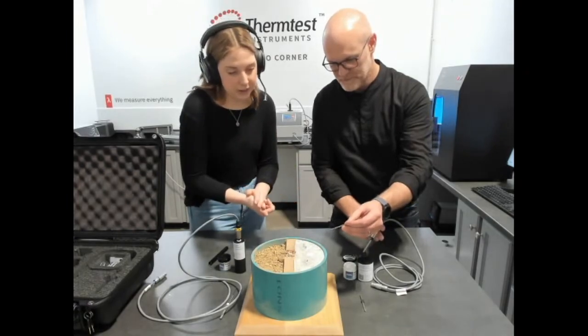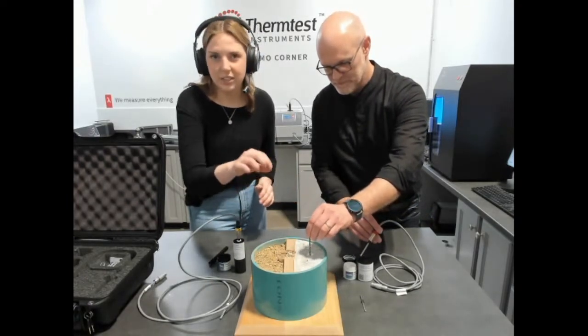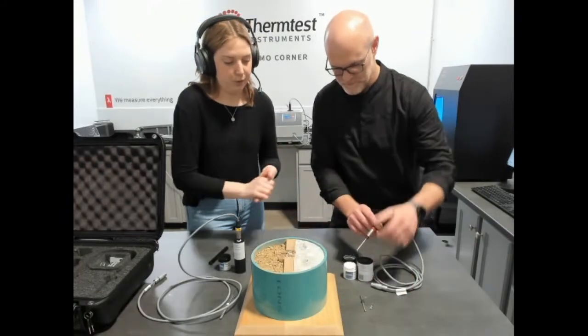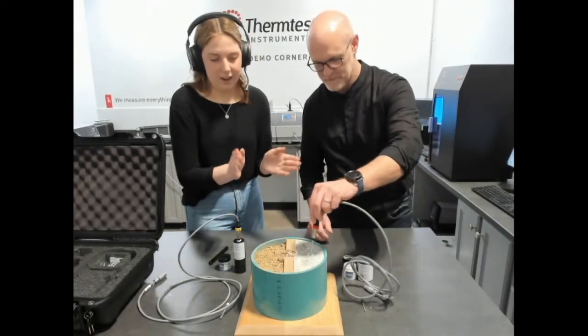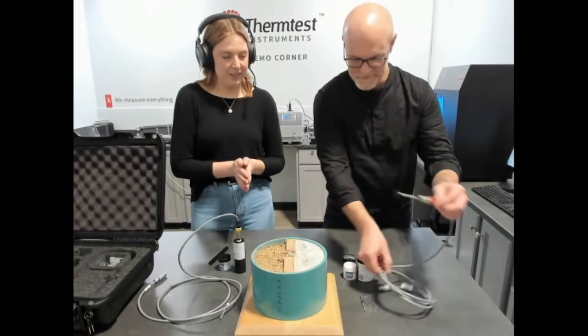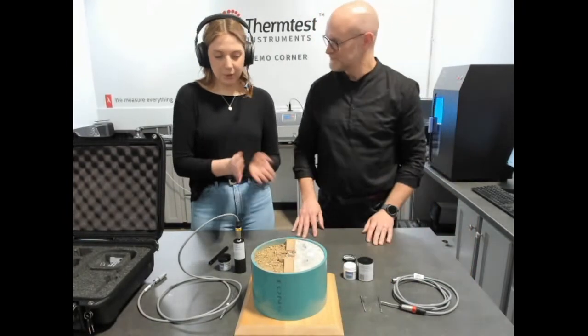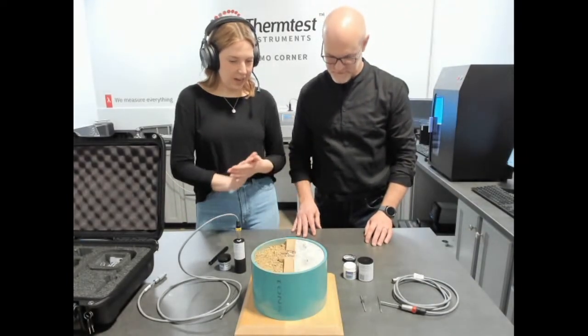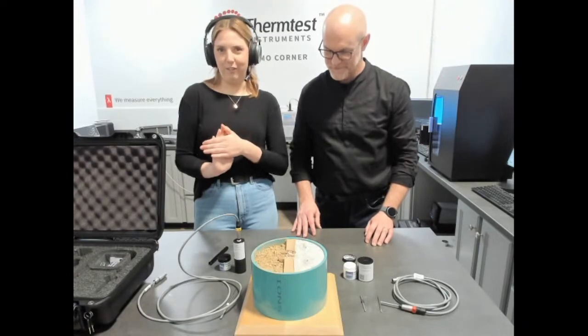This one also comes with a drill bit, and we could drill into more rigid solid samples and then insert our needle into the sample after applying our thermal paste. That's pretty much everything for making measurements with the TLS 100 and TLS 50. Thank you for listening and let us know if you have any questions.